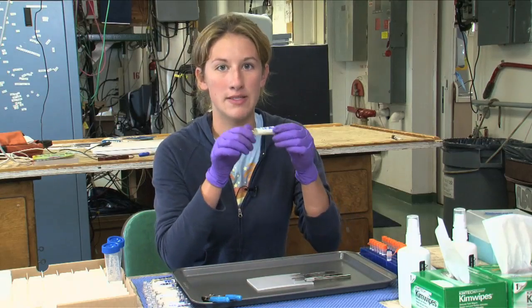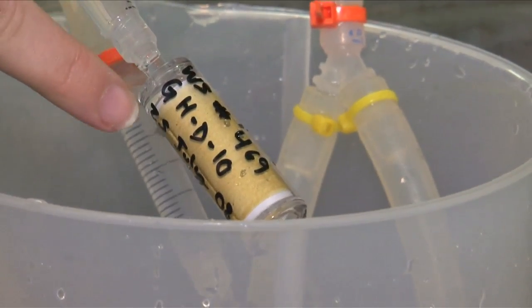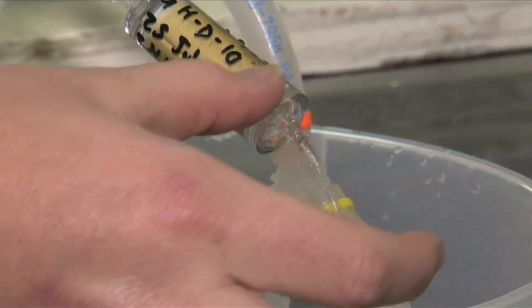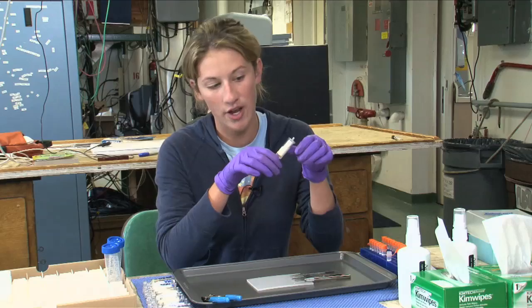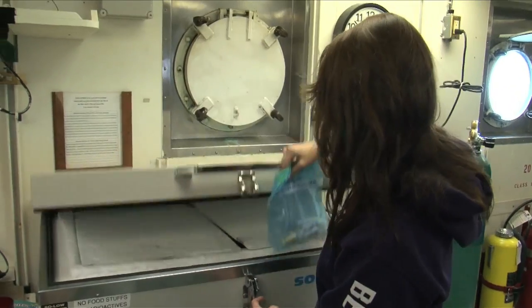So when we collect our DNA, we stick them in these Sterivex filters, and we pump water through them — usually, depending on whether we're in the estuary or the coast, five liters or even less than a liter. And then we put this DNA extraction buffer — we should call it DEV for short — to preserve them, and we put them in the minus 80.